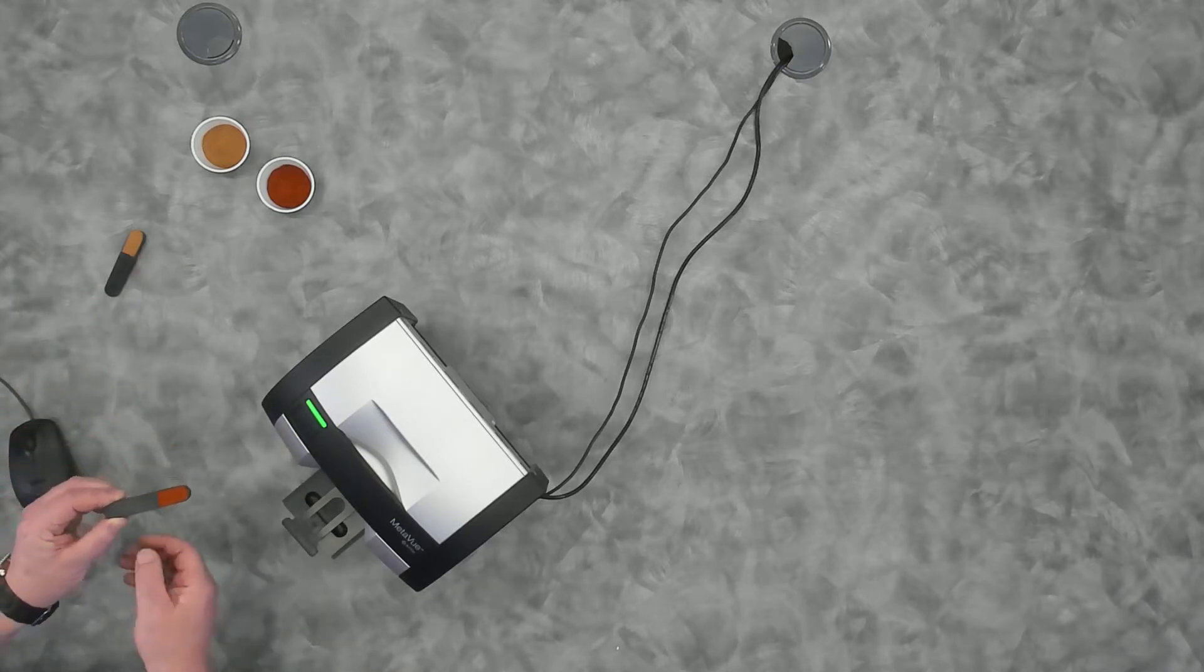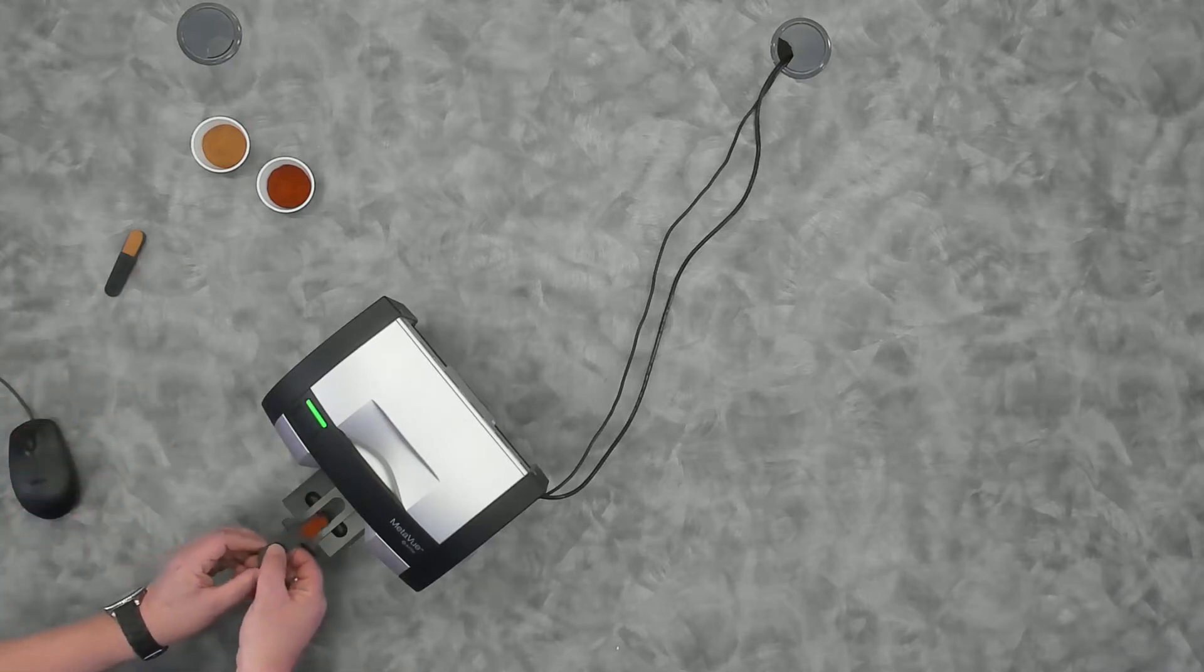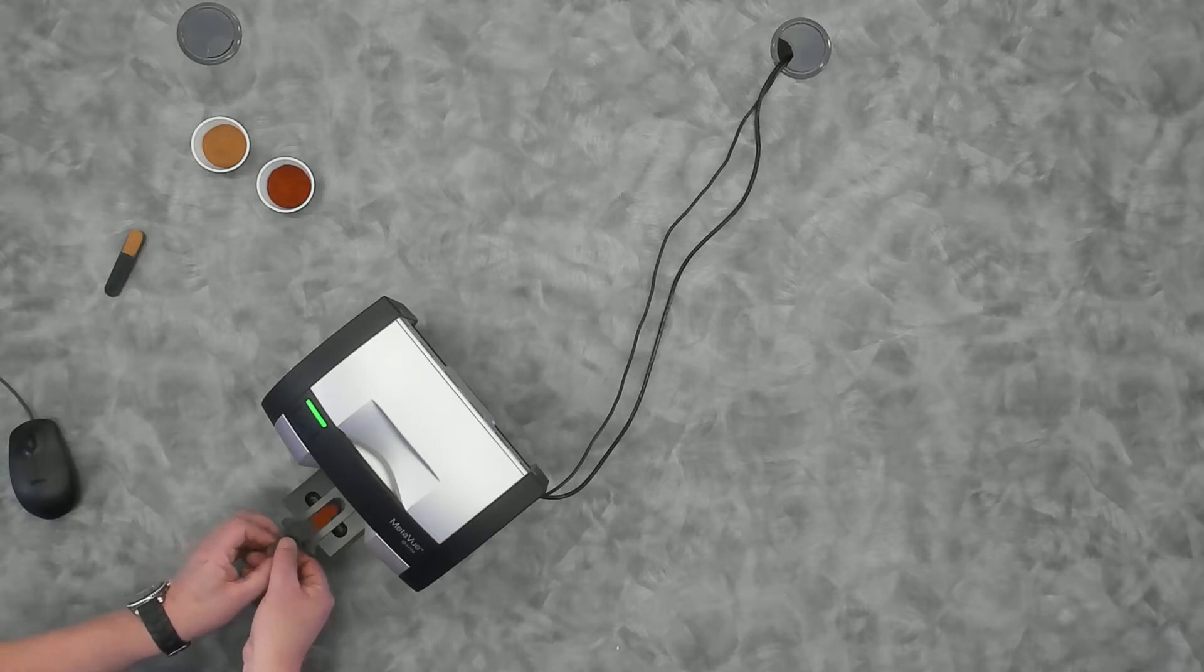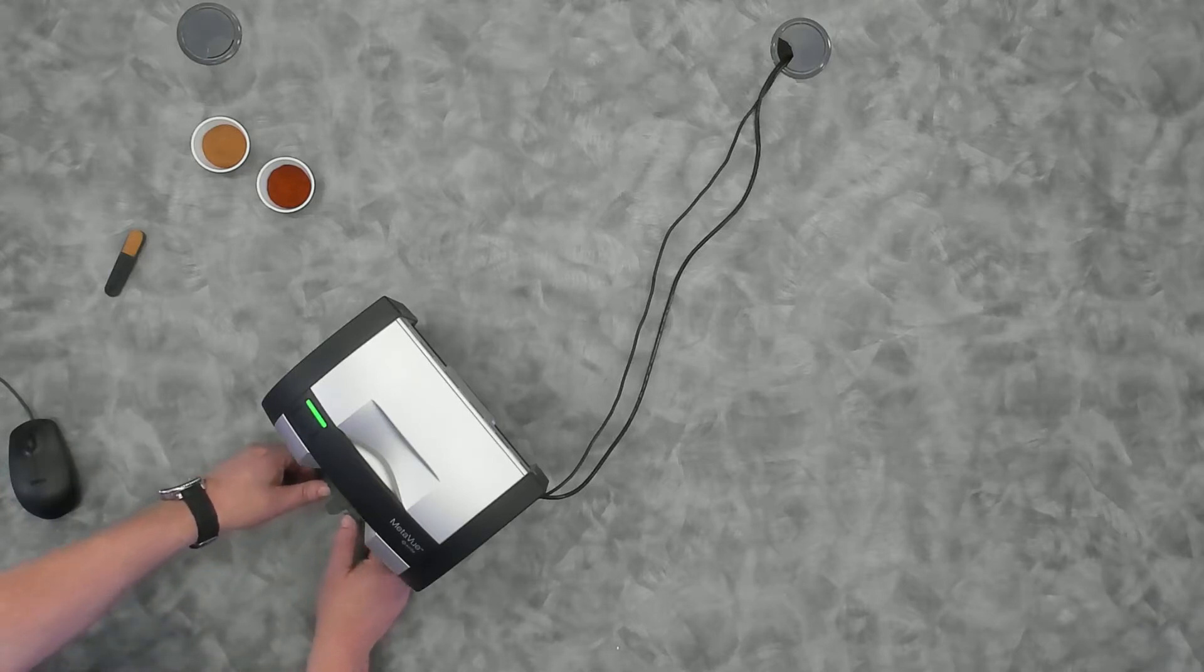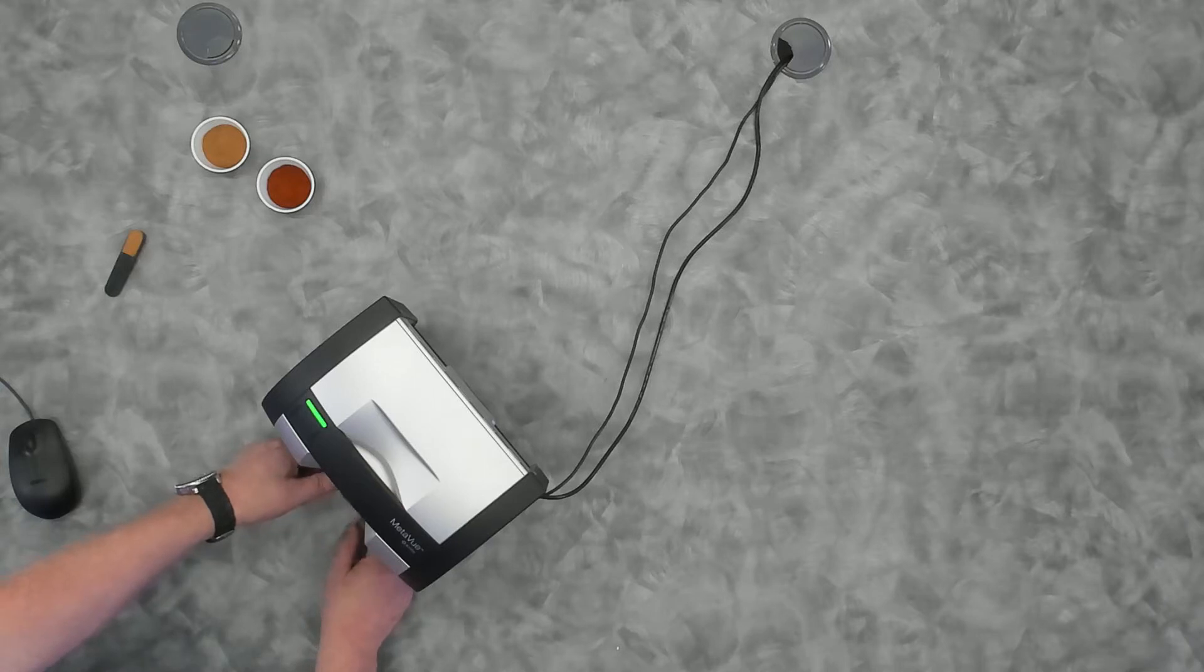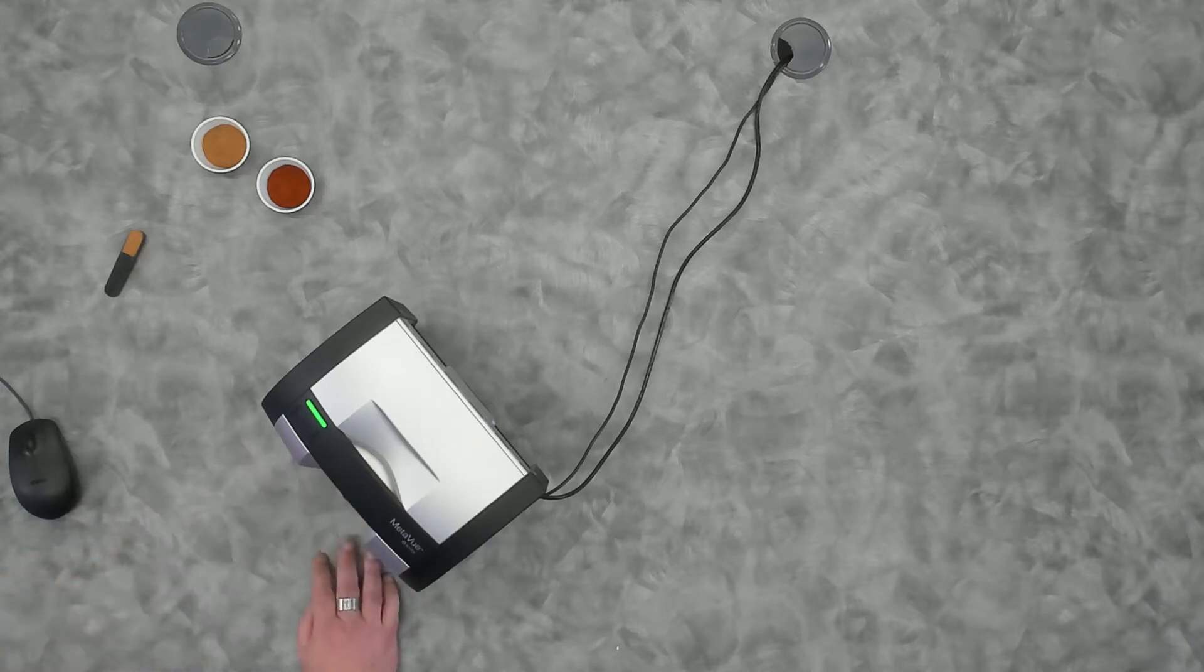That spoon fits right into this little cutout in place. I can now slide that drawer in, and it will position that powder exactly where I need it to take a measurement.